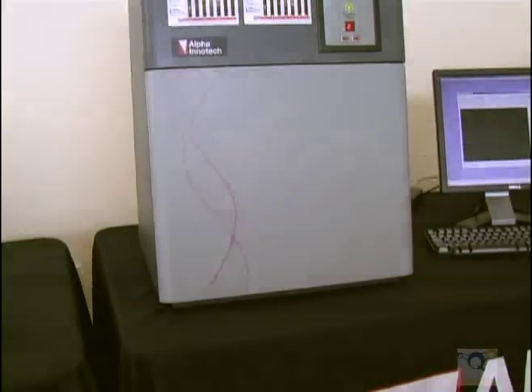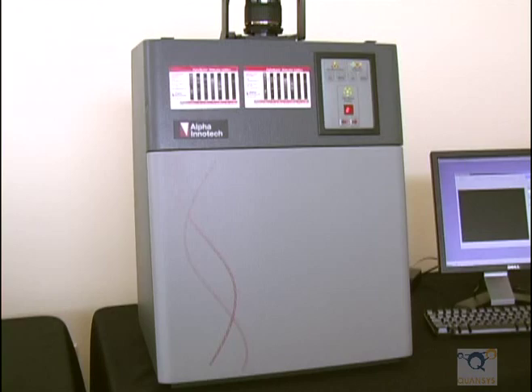Alpha Innotech FC2 Camera and Software Setup for Imaging Quansys Chemiluminescent Multiplexed ELISAs.